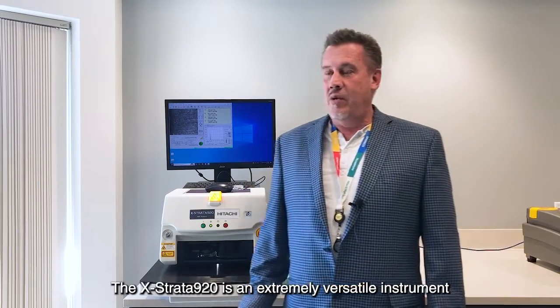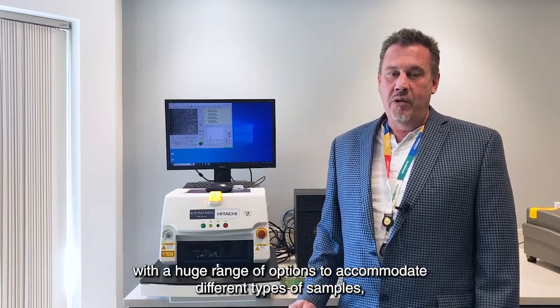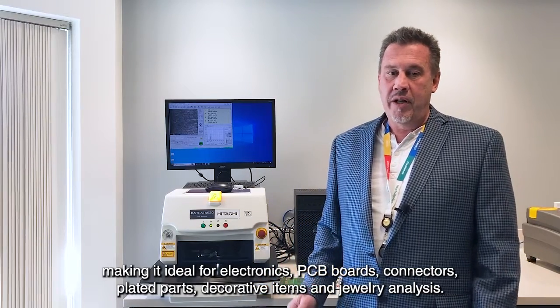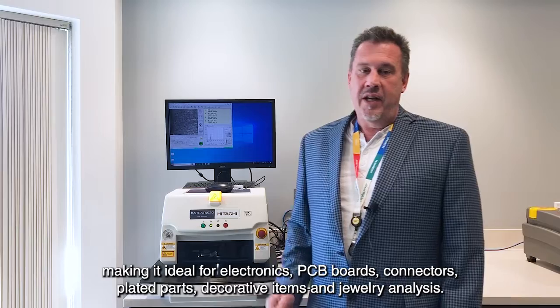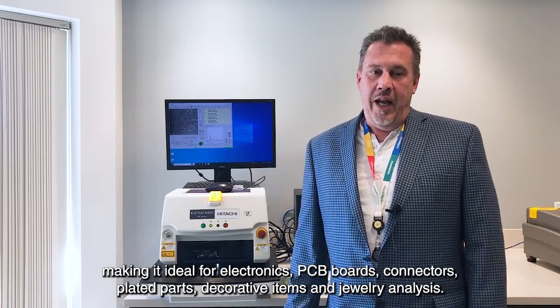The X-Strata920 is an extremely versatile instrument with a huge range of options to accommodate different types of samples, making it ideal for electronics, PCB boards, connectors, plated parts, decorative items, and jewelry analysis.